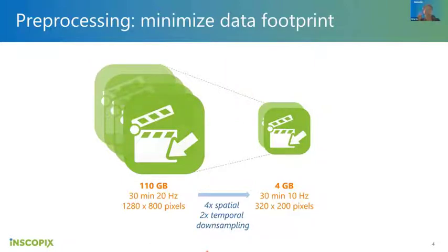Yeah, I think the default for the newer nVista and nVoke, we only have one format, right? I don't know about the old system. They have HDF5, and then you have to use the decompressor to convert and then import back into IDPS. Yeah, I think, do you have any troubles importing movies from our own system?